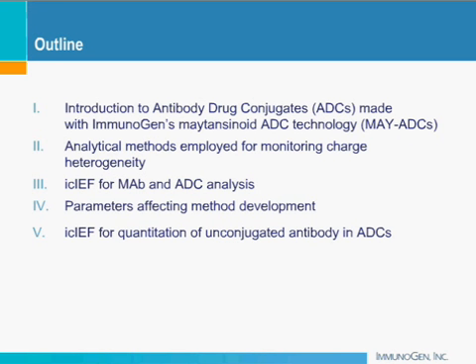Lastly, I will talk about an application of ICIEF, which is very useful in quantifying the levels of unconjugated antibody in ADC samples.